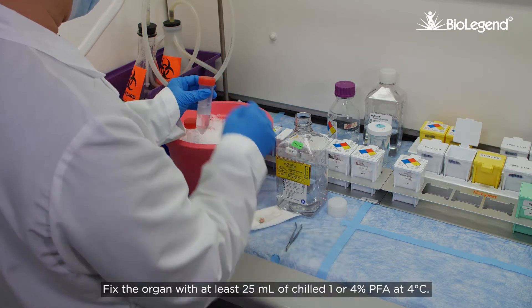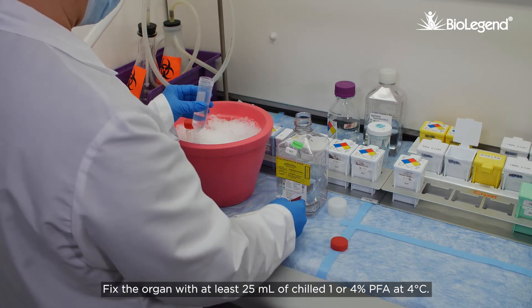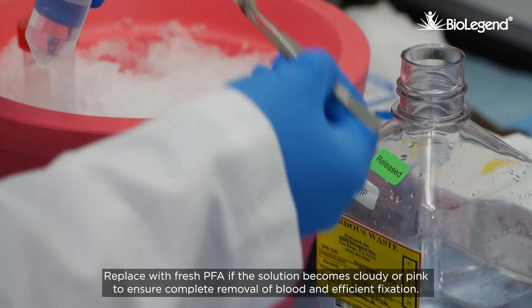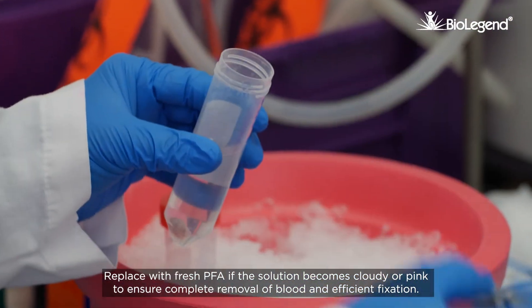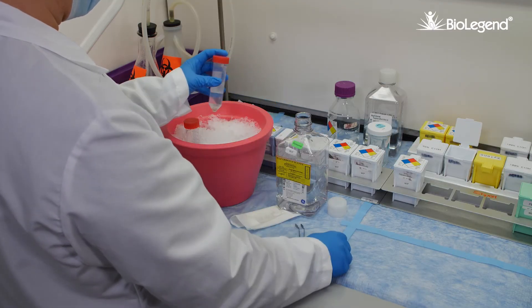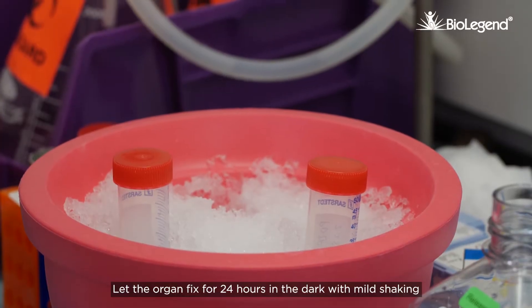Fix the organ with at least 25 milliliters of chilled 1 or 4% PFA at 4 degrees Celsius. Replace with fresh PFA if the solution becomes cloudy or pink to ensure complete removal of blood and efficient fixation. Let the organ fix for 24 hours in the dark with mild shaking.